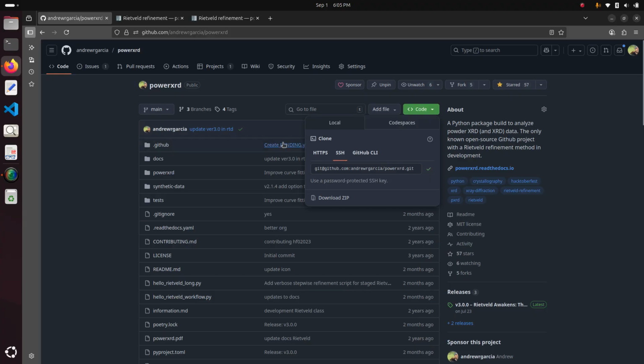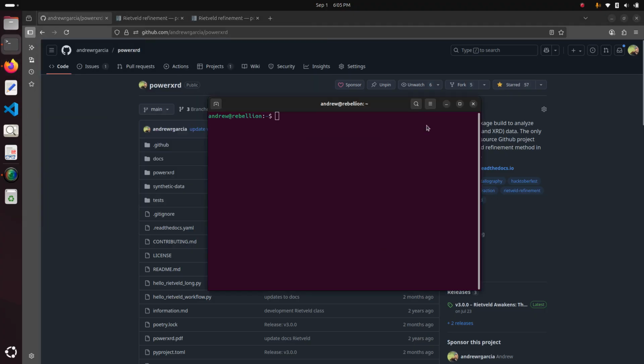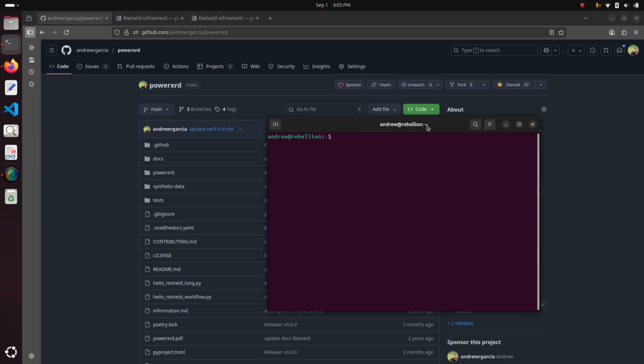What you're gonna do is you can clone this repository on your computer. We're gonna go git clone and that. I actually have already cloned it, so I don't have to do that. I'm just gonna access it. After you've cloned it, change the directory to your cloned repo. And now you can open it with Visual Studio Code.